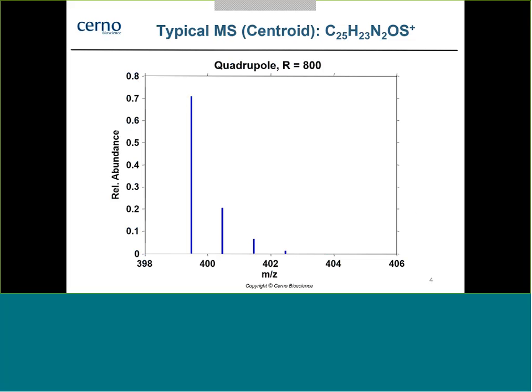Okay, first of all, like I said, a little background on exactly what this mass spec calibration is and how it allows us to perform accurate quantitative deconvolution, or mixture deconvolution. The first thing to understand is that a typical mass spectrum that you see in your mass spectrometer software is usually reduced to what we call centroided data. And that's what the user gets presented by the data system, as we can see from this example right here.